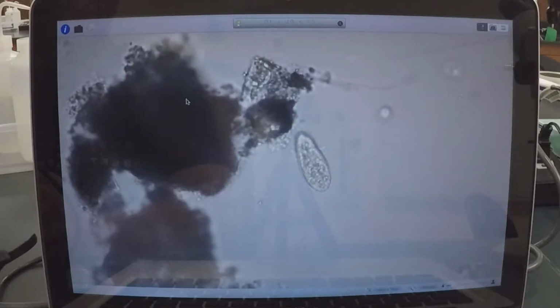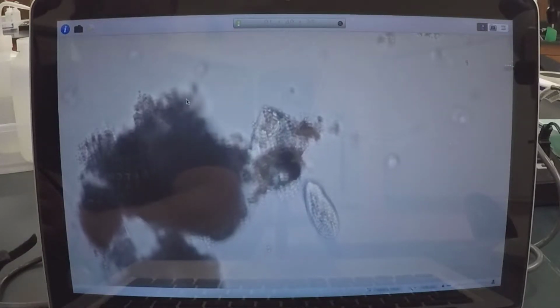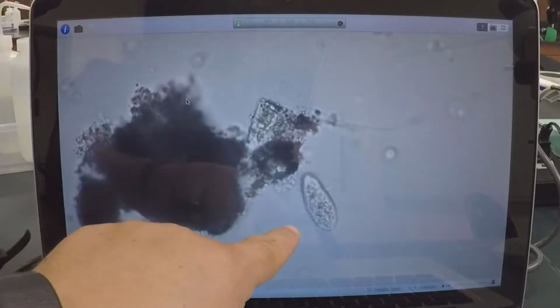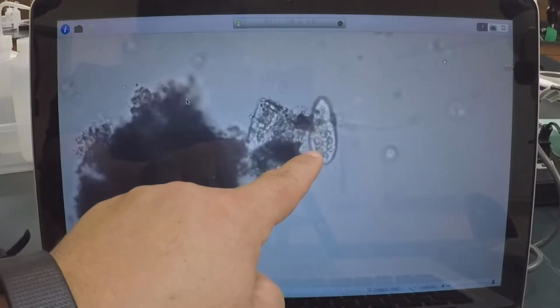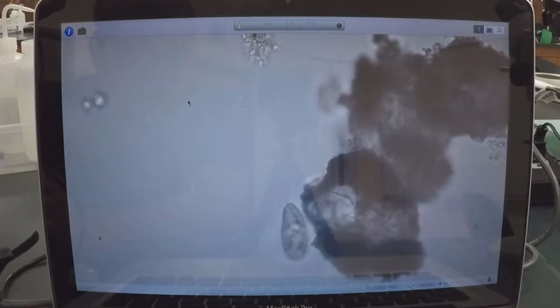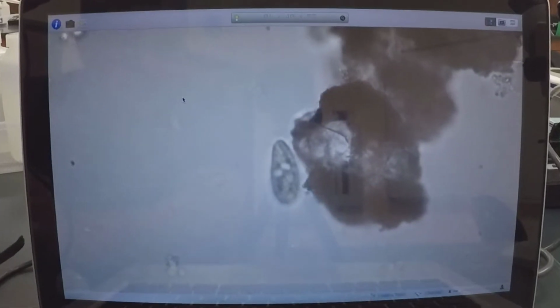Sometimes it's nice to be able to look at those so you can see the cilia. So if I really focus in on this guy, actually it's not dead. You can actually see it's consuming. It was eating things, and now it's moving, and now it's gone. Sometimes if you find one that is stationary, and maybe they're dead, maybe they're not, you can get an example of the cilia. You can watch the cilia beat along the sides. You can see these little rotifers and things flying through.